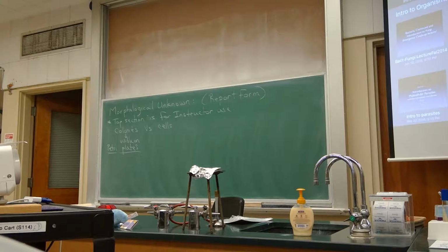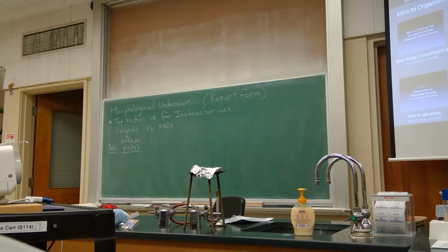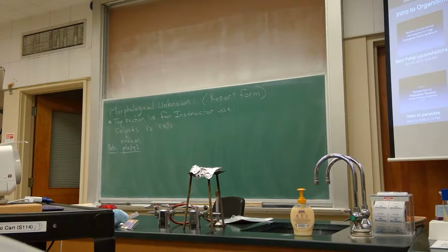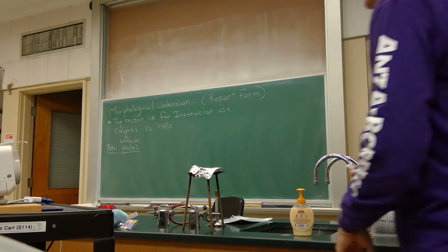Oh my word, plates. Agar plates. That's what these are. Plates. What's on here is colonies. So that whole section that is talking about colony morphology, that's where this comes from. And yes, you have to measure the colonies.